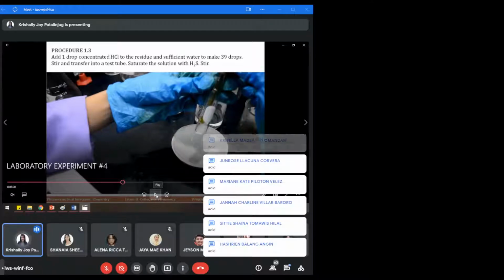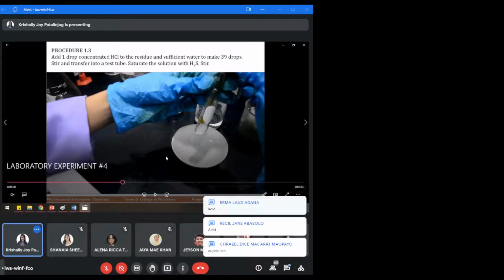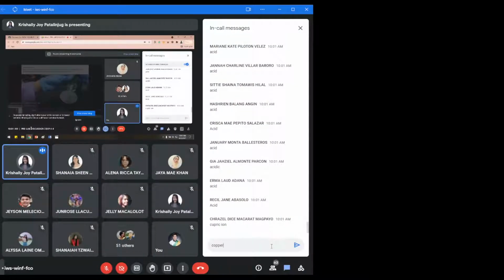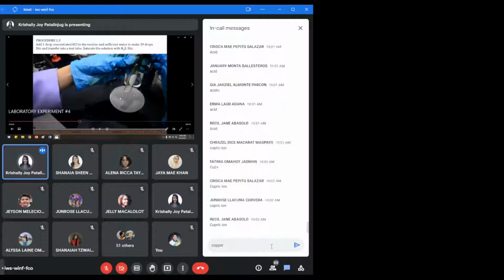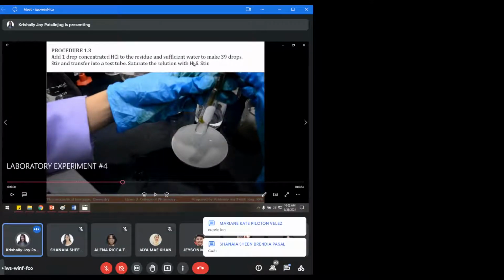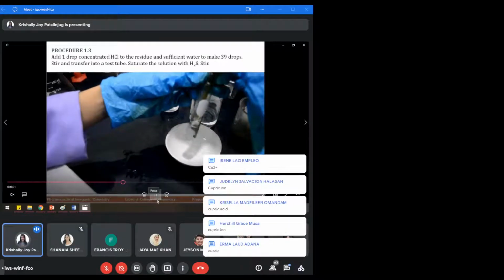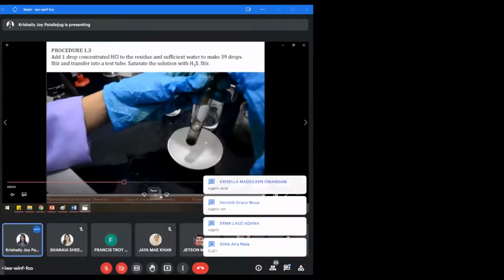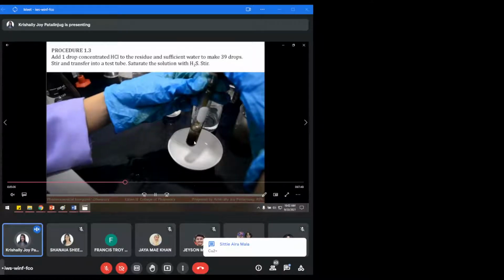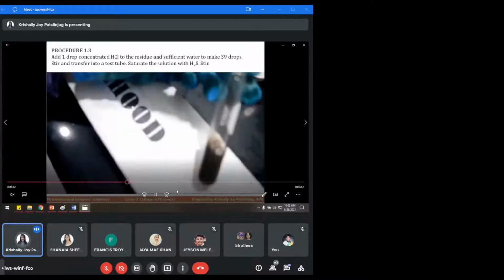Okay, question. Anong ion from 4 na natira ang maseseparate? Very good. Cupric ion. Because cupric ion is an acid insoluble sulfide. It will precipitate out in the presence of sulfide, acidic environment. Very good. Okay, at least you understand the concept of this activity. Okay, so tingnan, may precipitate. Yang mga na-precipitate, yung blackish, no? Form na yan later on. Okay?